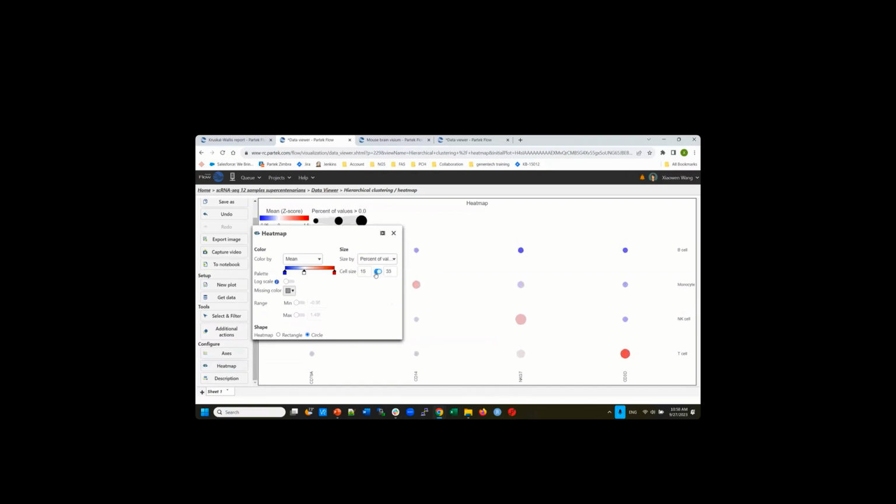You go to the heat map here. The default shape is a bubble map. And then the size, you can change for the higher and low expression. You can change the value. The lowest cell size is, suppose I use a 10 versus a 30. And so you can clearly see things here. Okay. Yeah, so this is another way.